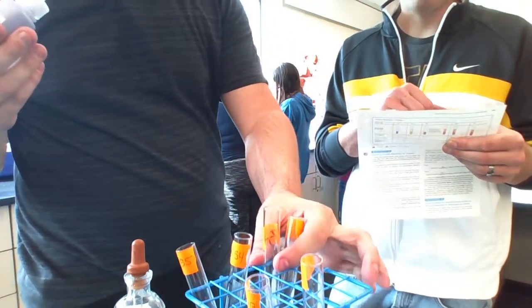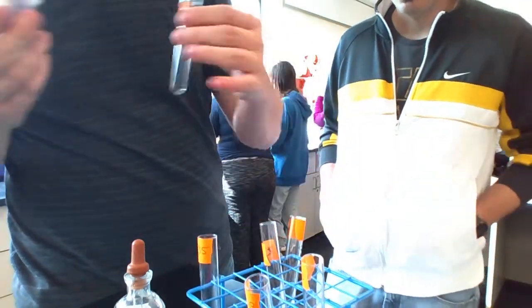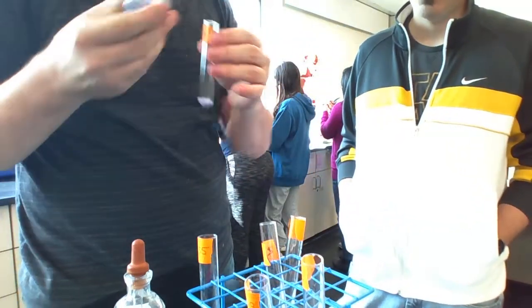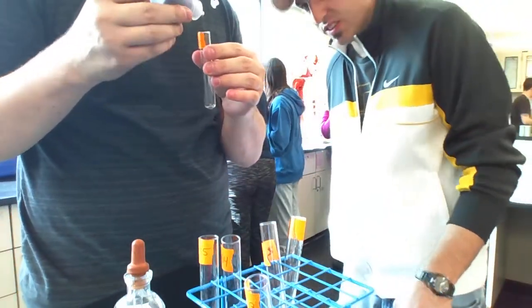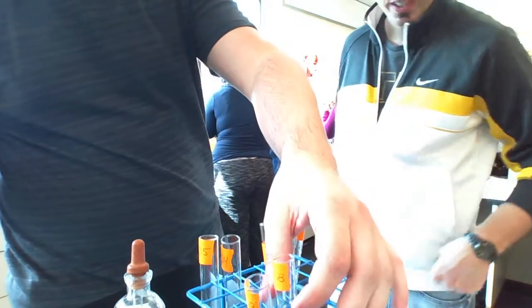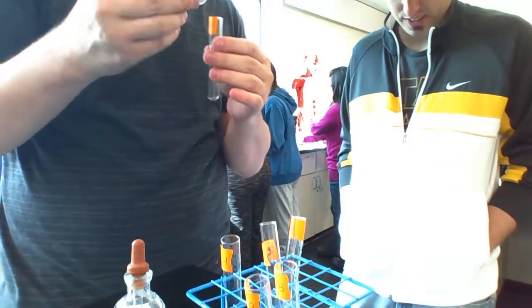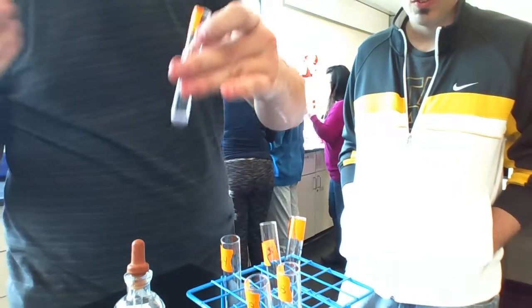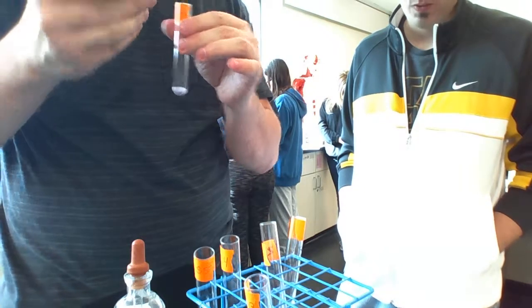Tube 4, 2, 4, 5, 4B, 5B. Well, we can just use a row, right? Okay, so help me out. So 4B also, and 5. So 5, 4B, 5B. I have a different lab manual. Okay, so 2, 5, and 4B and 5B. And then tube 3 will get it once it comes out of the water. So 1 should have 2 drops of water.